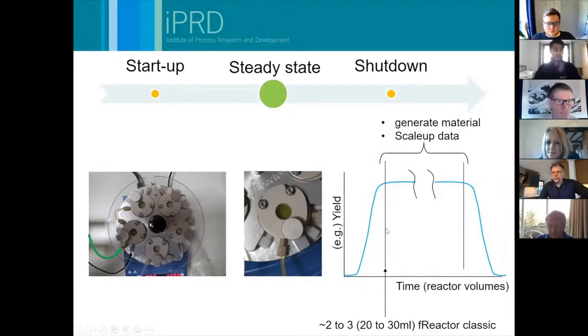Okay, so that's typically what we see within a flow chemistry situation, as opposed to a batch chemistry situation where we might bring our materials together and we don't continue to add. In some cases you can, but generally we bring our materials together at the start of the reaction, we stir them, and they change continuously with time until the end of the reaction is reached. So that's one of the differences between flow and batch chemistry.